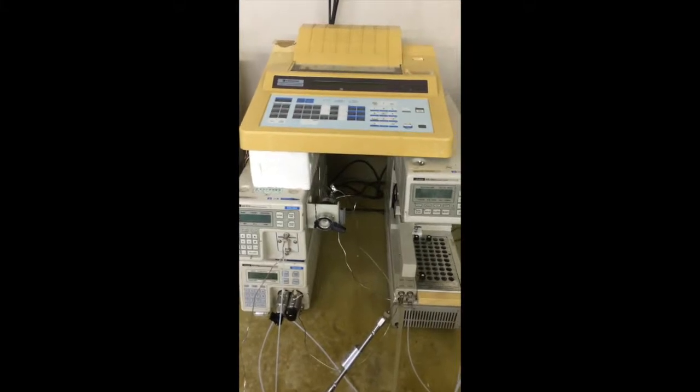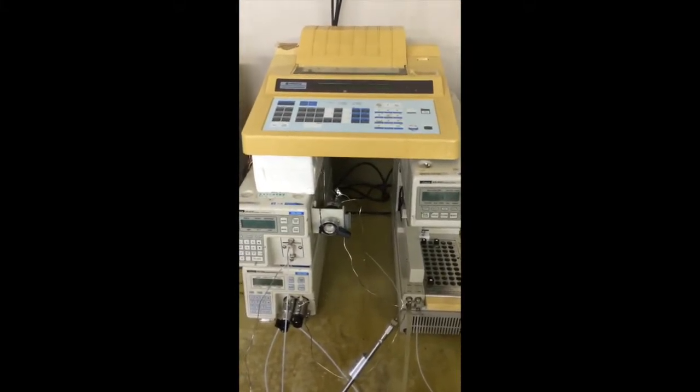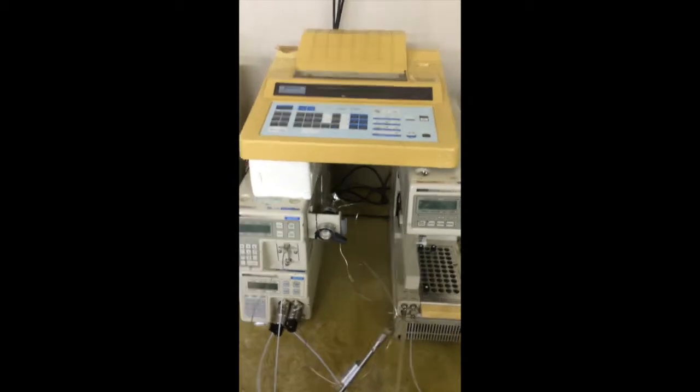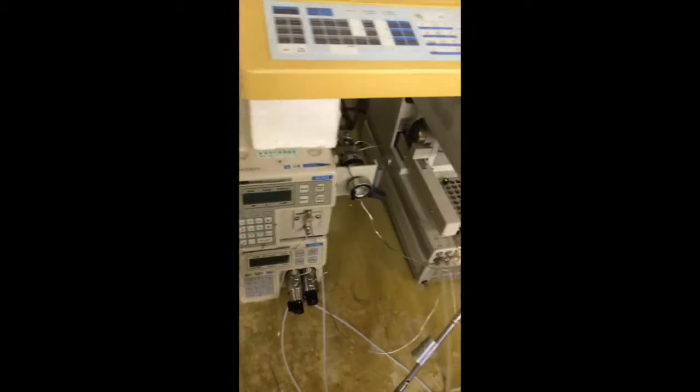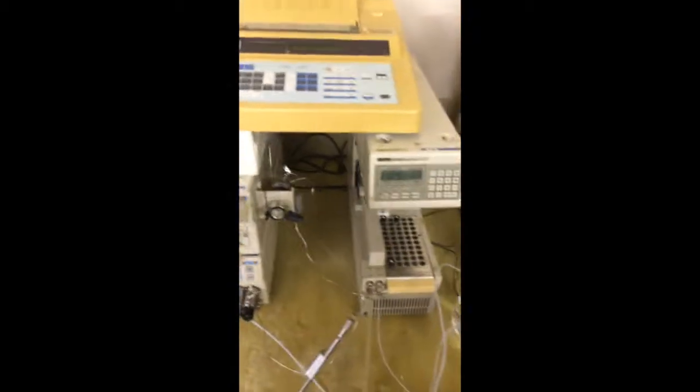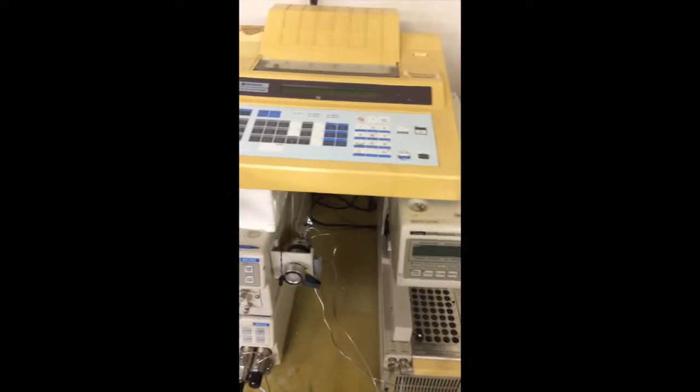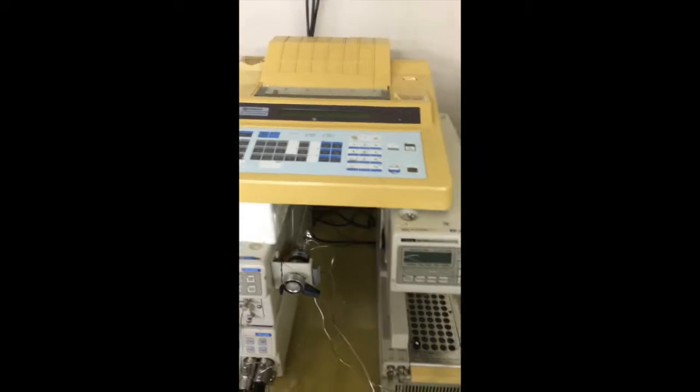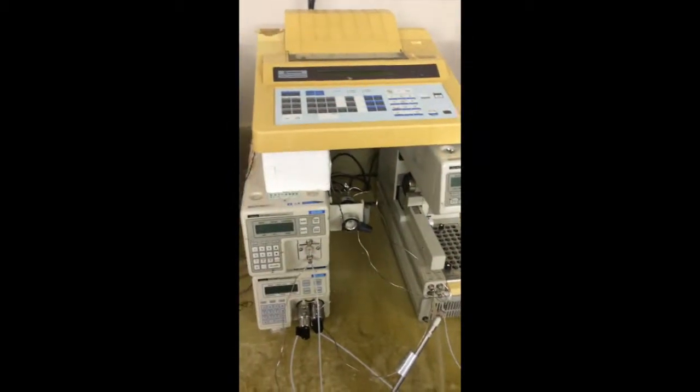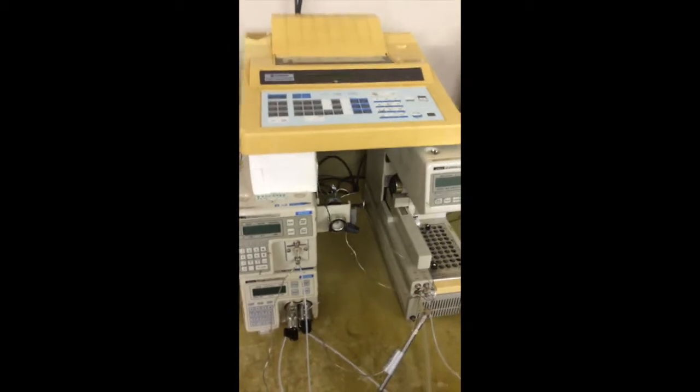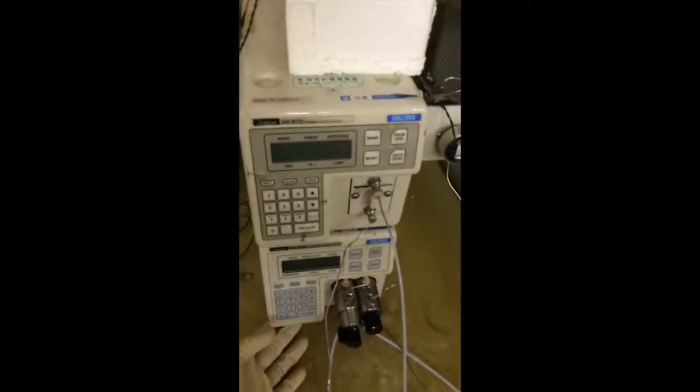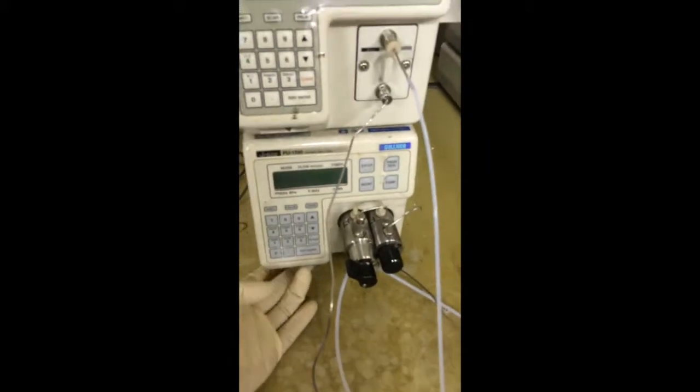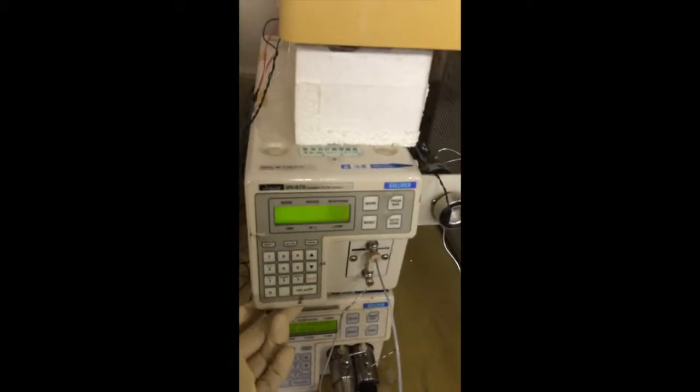Okay, I would like to share how to use this HPLC. This is the pump, detector, auto sampler, and integrator. Firstly, switch on all the instruments - first the pump, this is the switch-on button, and also the UV.